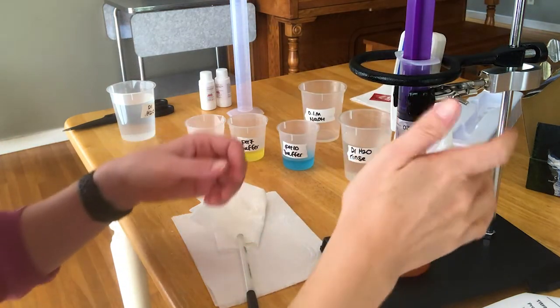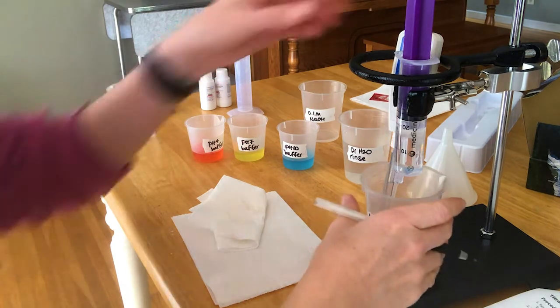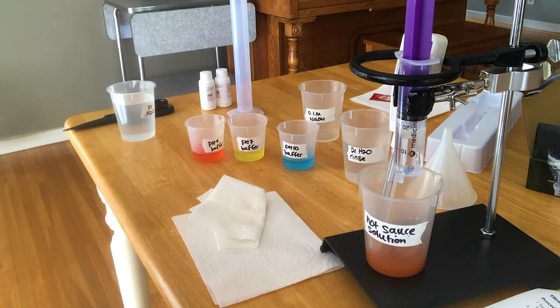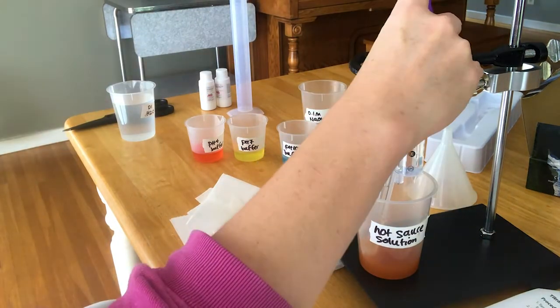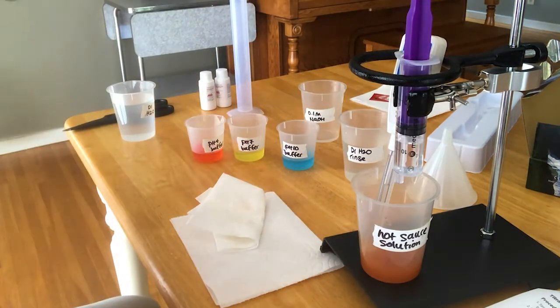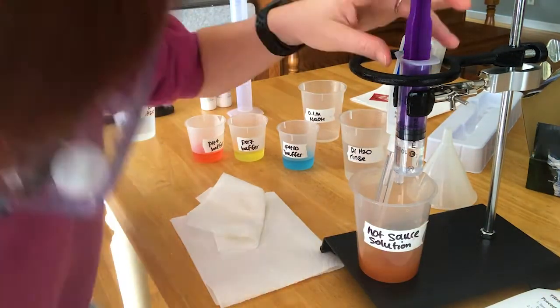Then swirl the beaker to mix it and measure the pH. Keep doing that until you get to the end of your solution. Since you're making a pH titration curve, the pH is going to increase very slowly at first and then increase very rapidly — that's where you're going to find your equivalence point. After that steep part of the curve, you want to keep going just a little bit further into the basic region around pH 12 so you can get the other side of the curve, the excess sodium hydroxide region. Once it stays in the basic region and isn't climbing steeply anymore, that's when you can stop.